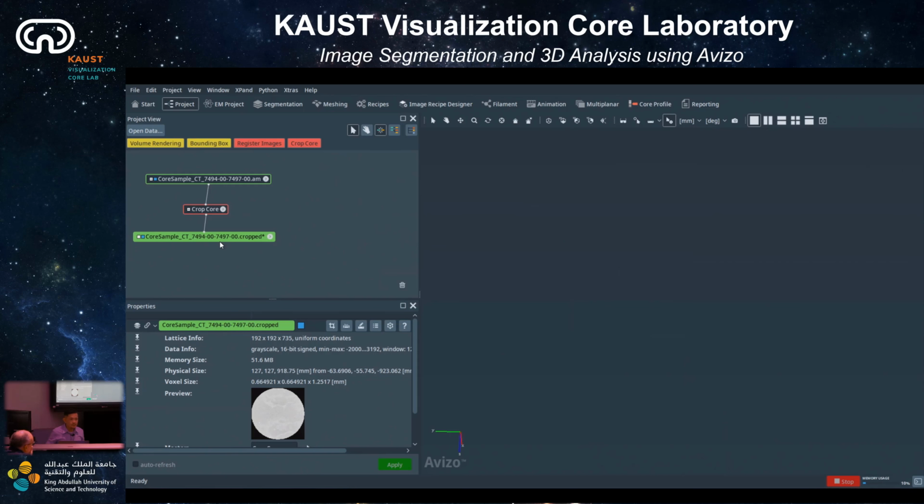Yes, you have to click on edit, and you will see the list of the color maps. You just select grayscale. I think you delete it. No problem. Go to options, load color map, and then select grayscale. Grayscale.